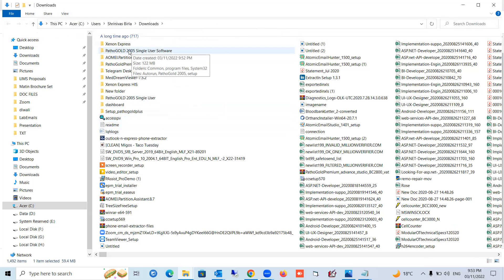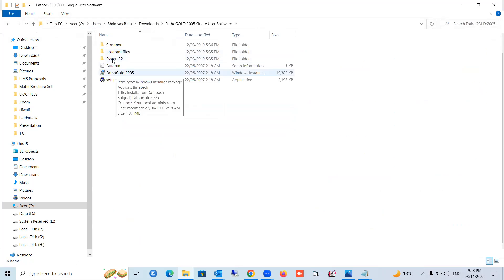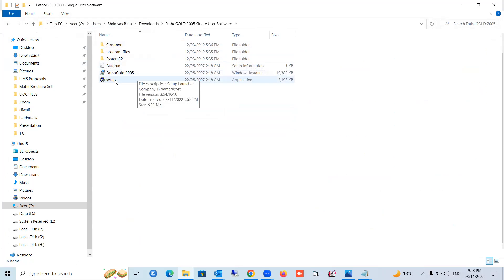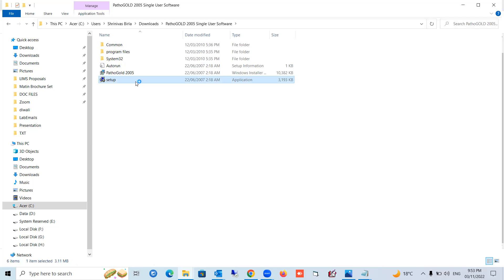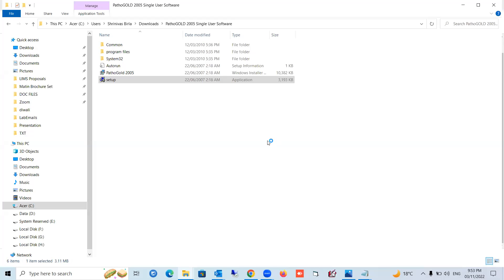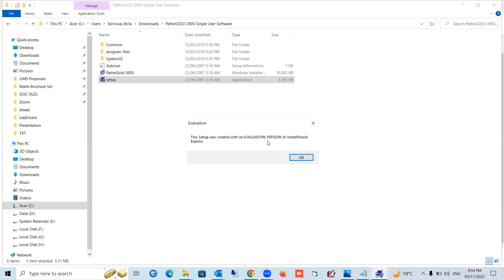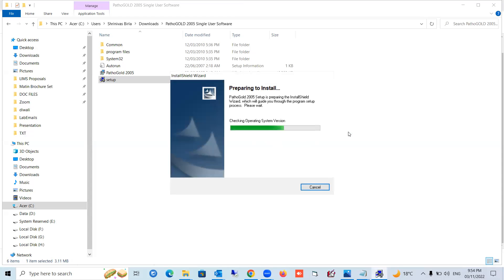Find the application file, right-click on it, and select 'Run as administrator'. Click yes when prompted. It will then ask you in which drive you want to install it. Press OK here — it is now installing.